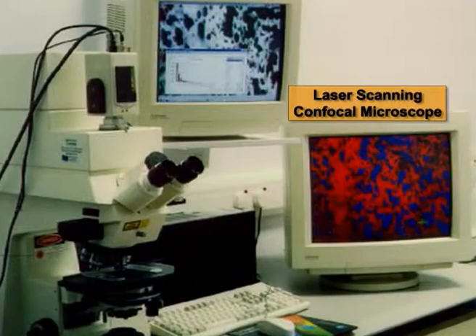What it does is, if this is the surface of the sample, light first impinges here and then a raster scan happens. So it's a zigzag scan so that all XY of the specimen is sampled. Then, depending on the position of the second pinhole, it moves to the next layer, and similarly raster scanning of the second layer happens.